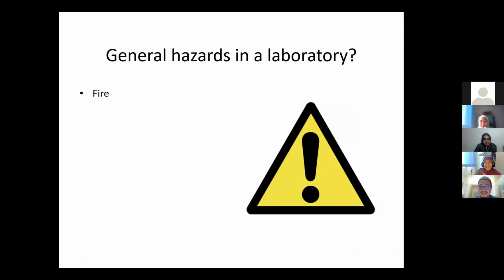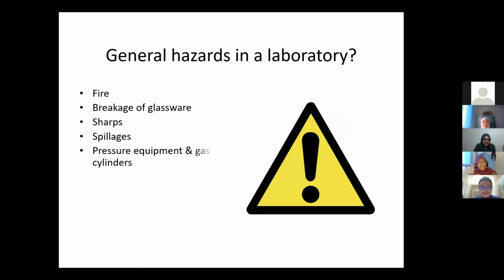Okay, general hazard in the lab. What hazard can you find? Fahana very happy ni. Awak pernah buat ke Fahana? Pakai hand sanitizer sebelum makan. Oh. Okay. General hazards could be fire, breakage of glassware, okay, sharps, spillages, pressure equipment and gas cylinders.